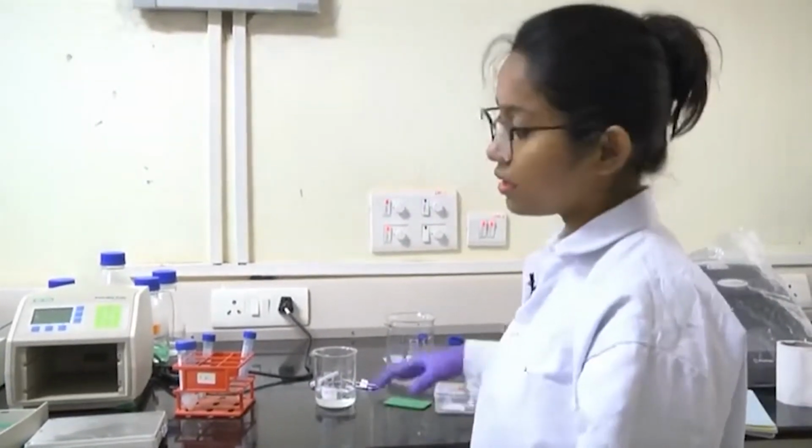Now the specificity of the secondary antibody is high, and it will bind to the primary antibody. Also another important feature of the secondary antibody is that it has some conjugated enzyme, for the detection purpose. So either horseradish peroxidase is there, or alkaline phosphatase.